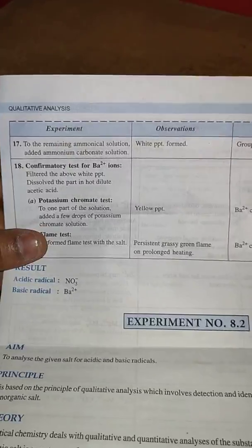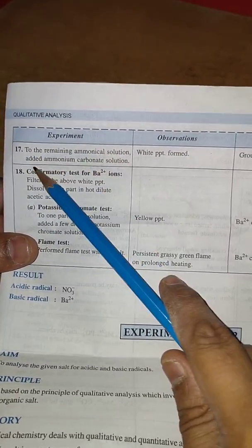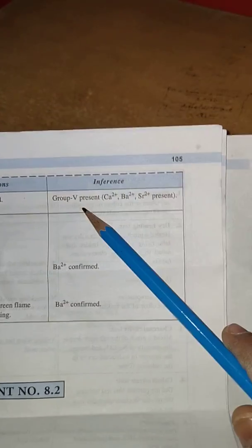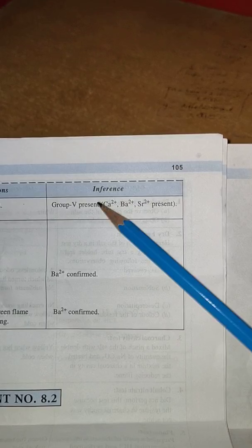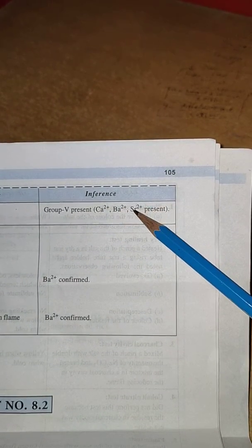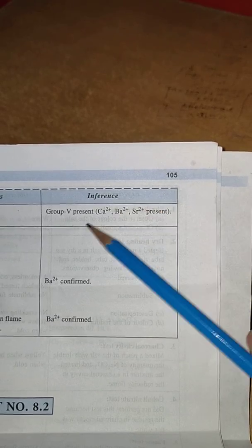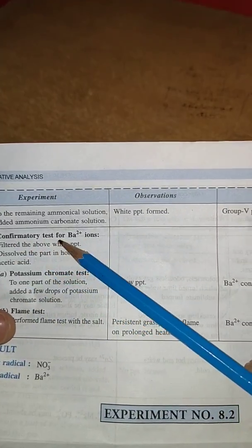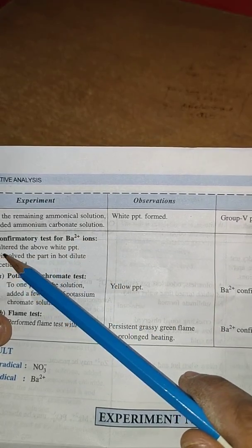Now come to the end of the practical: to the remaining solution add ammonium carbonate solution. White precipitate is formed, that means group fifth present. Group fifth includes calcium, barium, and strontium. One of these three will be present.